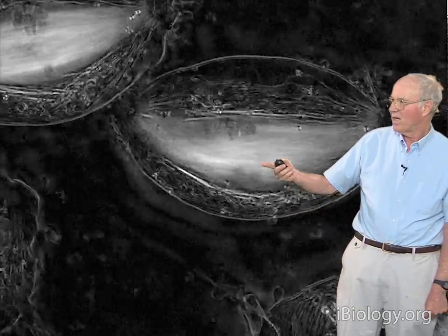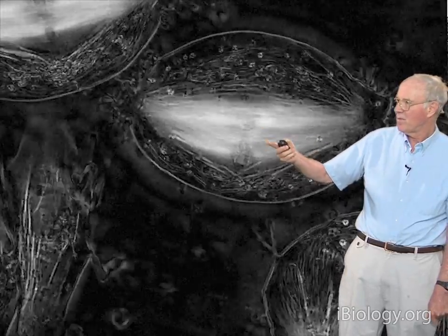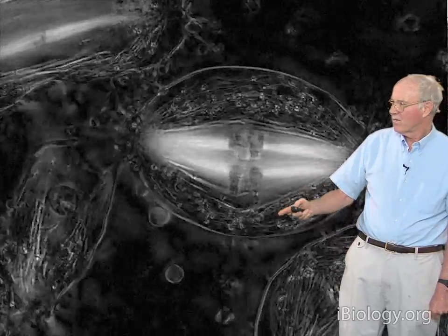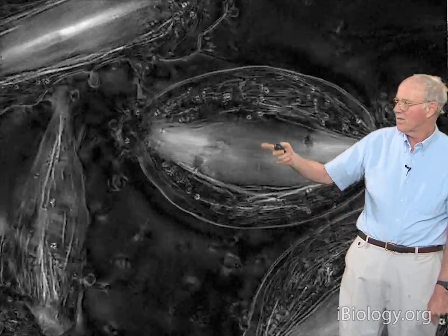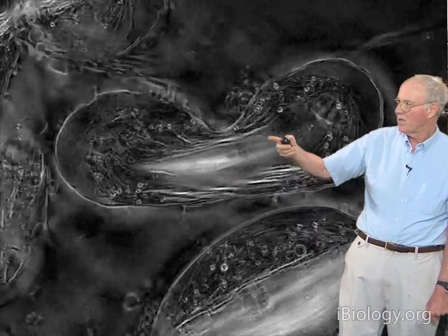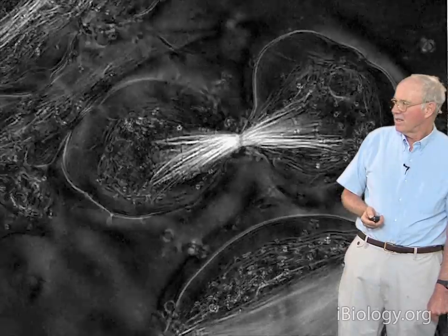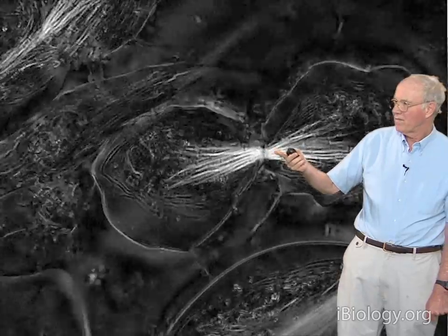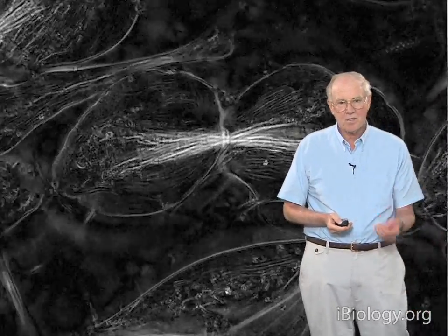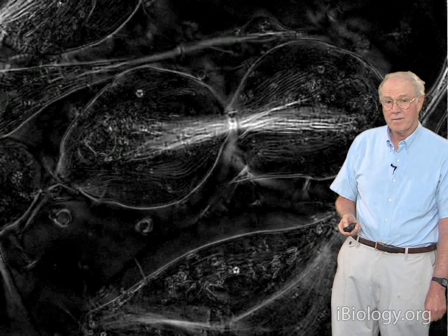And so the brightness of this image is directly proportional to the microtubule number and the thickness of the fibers at this stage. And this is true for the plasma membrane cortex or for the mitochondria that are in here. All right, and these are mitochondria bundles that are coming in here at the end. And so a great deal of quantitative information can be gotten from these sorts of images now, as well as just being able to see structure in transparent cells by this type of technique.